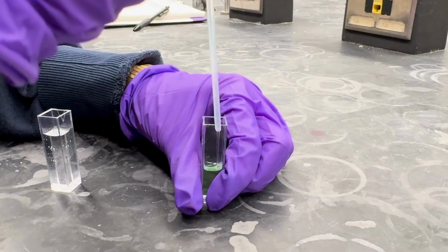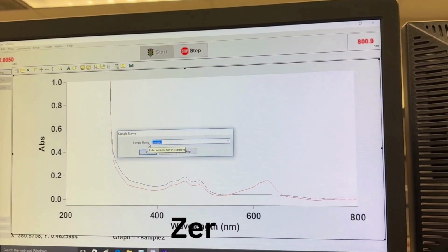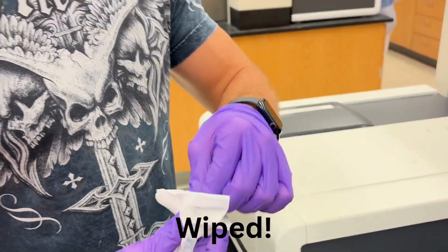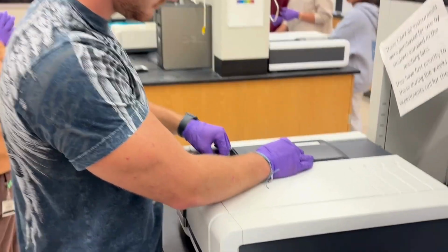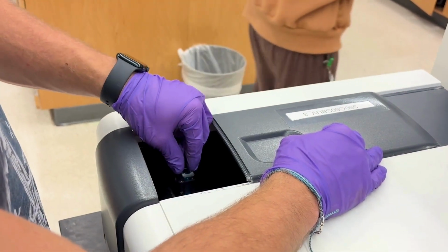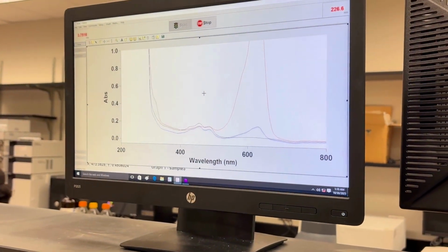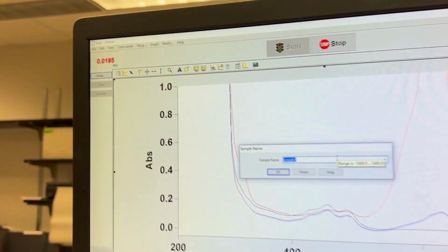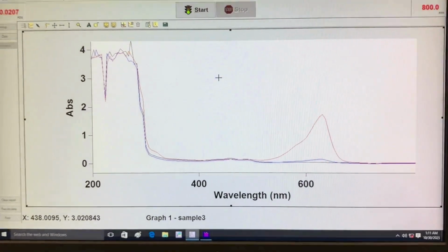For example, scanning ensures we are not missing peaks at unexpected wavelengths, and it allows us to compare two samples that might have similar absorbances at other wavelengths but different lambda max values. Lambda max is defined as the wavelength at which a compound has its highest absorbance. Using this wavelength ensures our absorbance measurements are accurate and reliable. By scanning all wavelengths, we can also compare absorbance values, quantitative, and the shape of the absorbance curve, qualitative data, to fully analyze our samples.